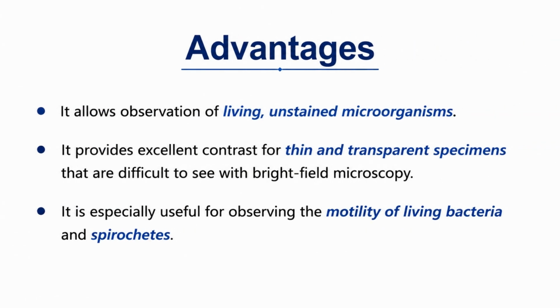Advantages: allows observation of living, unstained microorganisms. Provides excellent contrast for thin, transparent specimens that are difficult to visualize using bright field microscopy. Ideal for observing the motility of spirochetes and other delicate bacteria.